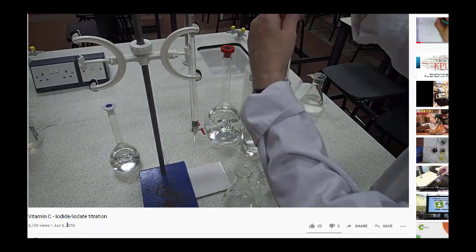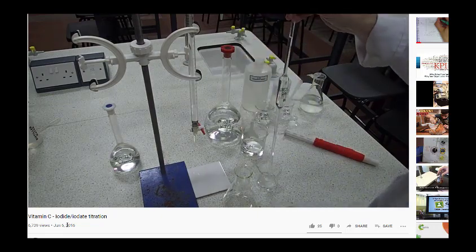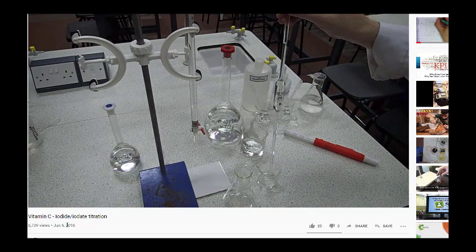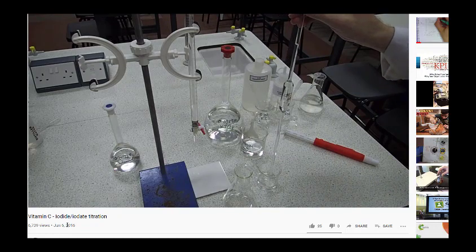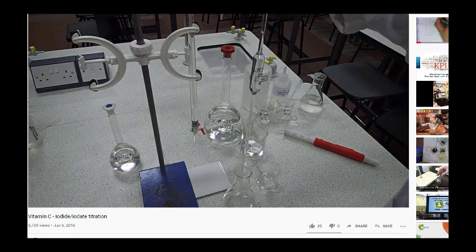Now I always prefer to use my finger control, so at that point I take the pipette filler off and use my finger to adjust to the line. I find I get more control that way. So there, 25 mils.